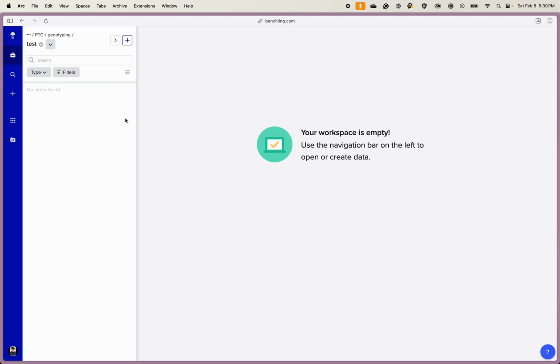I'm going to go over also, there's going to be a 2-for-1 special here. I'm going to go over the stuff for the TAS2R38 gene in reference to building primers, getting a genomic sequence onto Benchling and how we go about that. In class 5, the pre-videos for class 5, you saw how it was done for APE. So we're going to do a little bit the same thing here for Benchling.